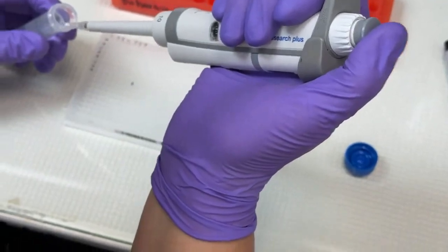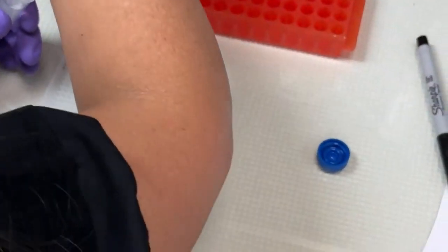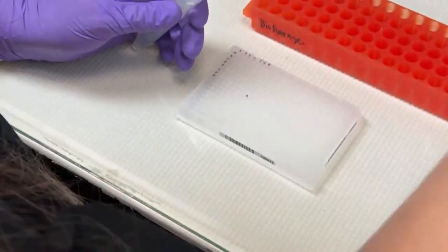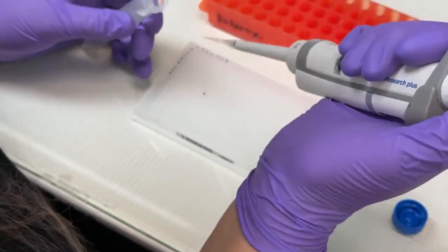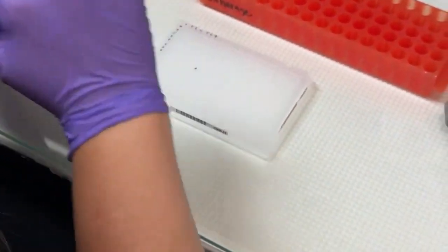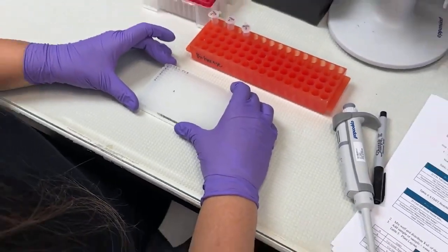Also, if you have process issues or contaminated reagents, you'll see them again in those no template controls. So please always use those. They are important. Don't skip them. It's really not worth the savings if you have to go back and do 4, 5, 6 experiments because you simply skipped your no template control.